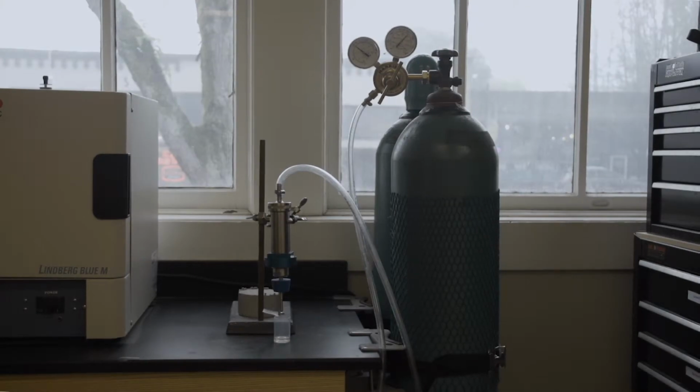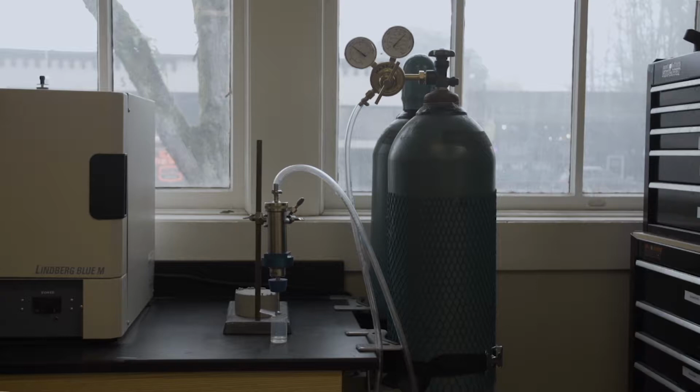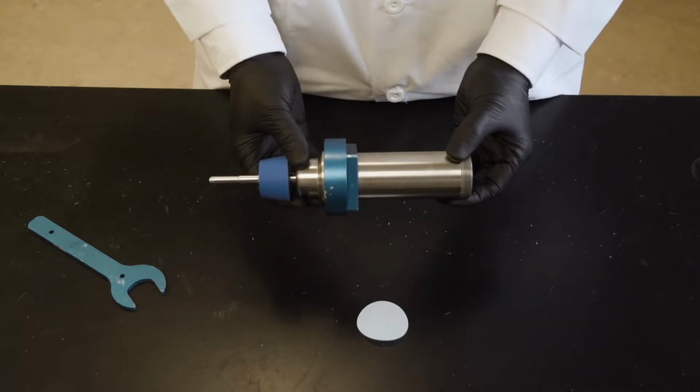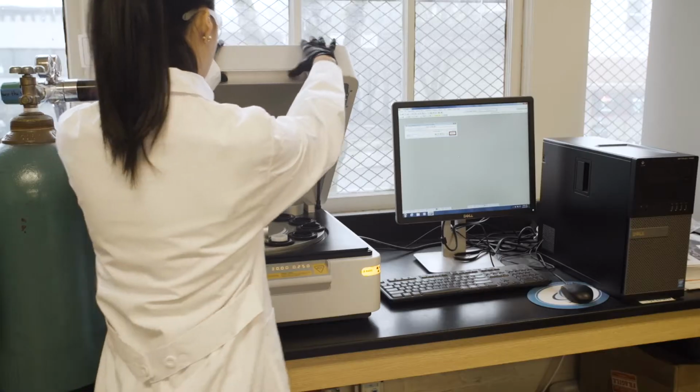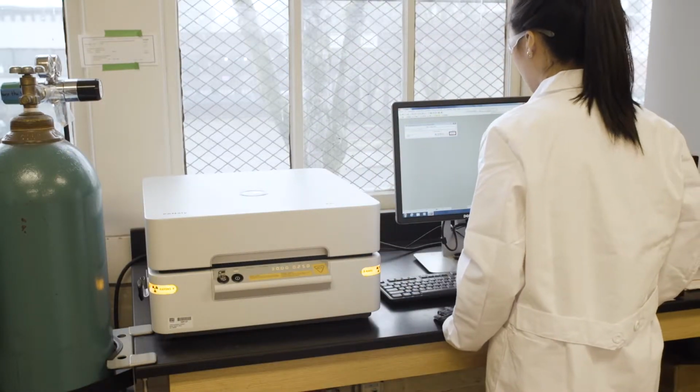The overall goal of this procedure is to describe a method to express fresh pore solution from a plastic cementitious-based system using a stainless steel pressurized nitrogen gas filter, and to measure the pore solution chemical composition using an energy dispersive X-ray fluorescence benchtop spectrometer.